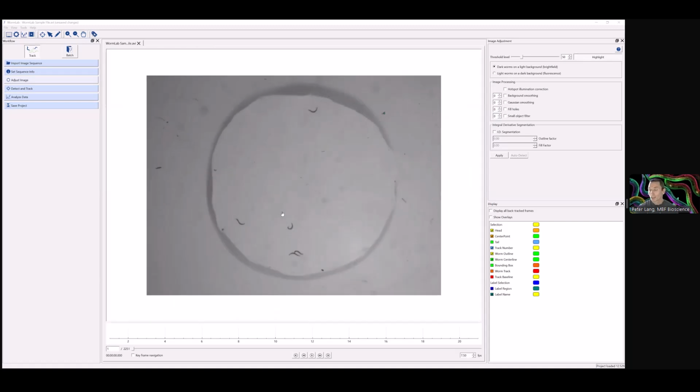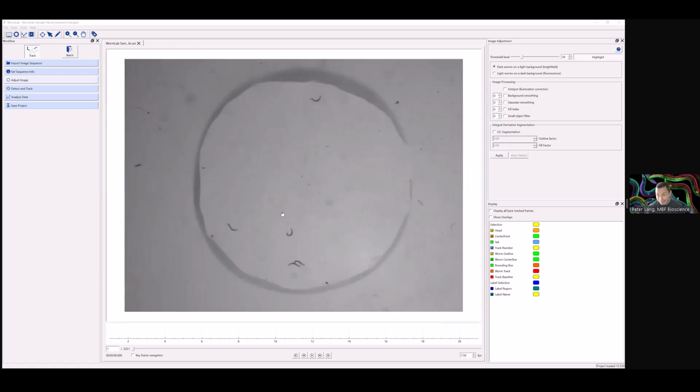All right, so here we are, our first swim video. This is a little over 2,200 frames, over a 5-minute period. The first thing you'll notice is the frame rate. The acquisition frame rate is about 7.5 frames per second. It's not something I would typically recommend for swimming assays. As I said, we probably want to be anywhere from like 15 to 30 frames per second.